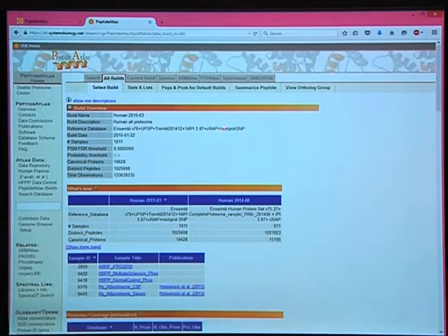So what we do here: a couple of different databases annotate SNPs. They give you a primary sequence and say, okay, at amino acid 33, that alanine can be a valine or a threonine. So we take that and encode it in a peptide with some context and put it at the end of each protein. It enables us to actually search for all these variants.